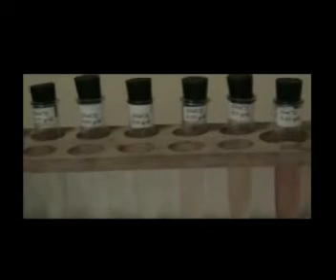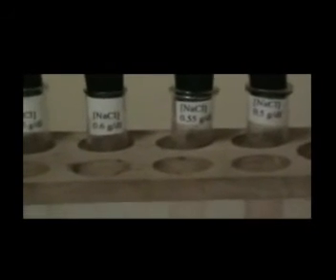And the next tube has more color intensity, so more hemolysis. So here you can see where the hemolysis starts, in the tube with the 0.55 sodium chloride concentration, and then the hemolysis increases with the reduction of the concentration, with increasing color intensity in the next tubes.